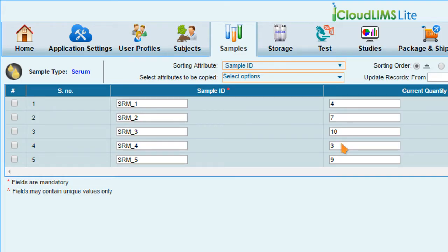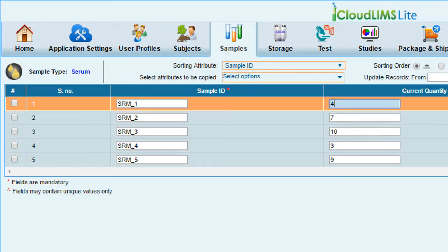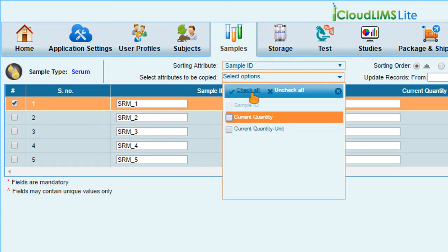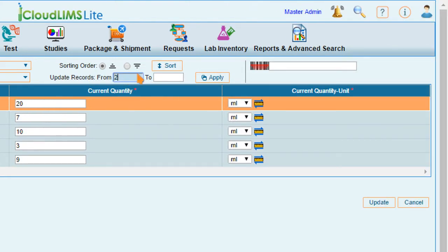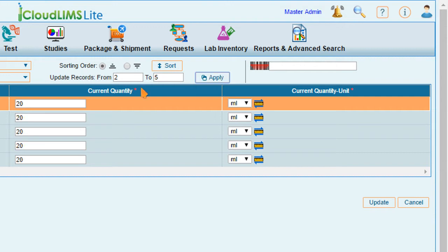Enter the required value in the first sample, and then select the records to be updated with sample value by specifying the serial numbers from 2 in the Update Record field. Click Apply to enter the value throughout the selected samples.